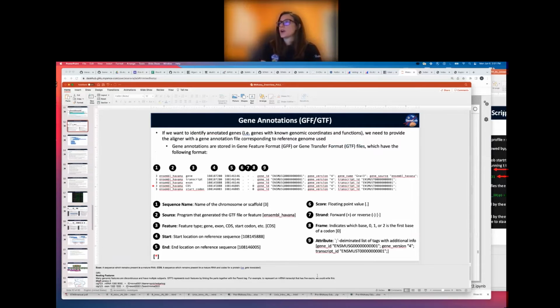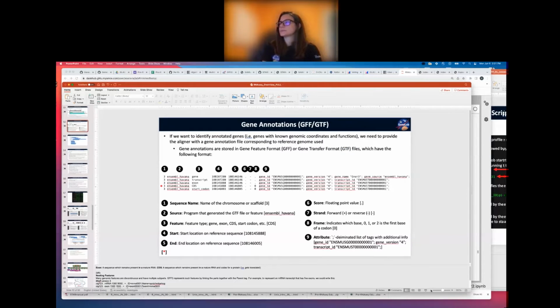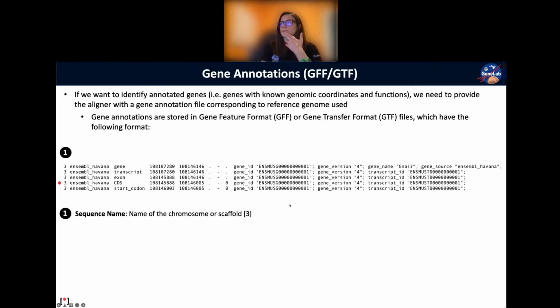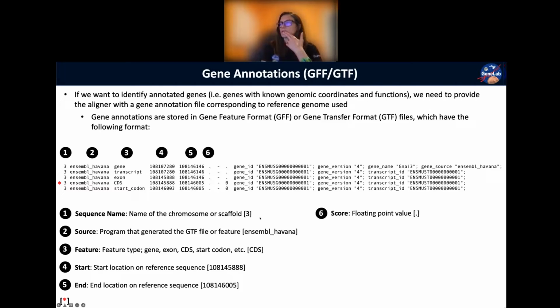So if you remember our GTF file here, and keep in mind when you sequence, when you have a reference genome, so number 7 here, when you have a reference genome, it was just a sequence that was put together to create your reference. And so the sequence that was used to generate your reference could have been derived from the sense or the antisense DNA strand.